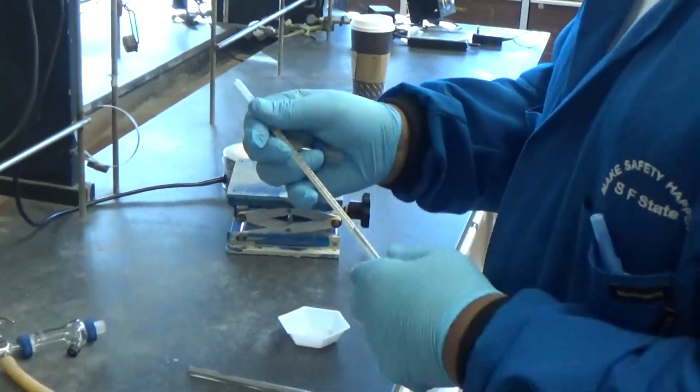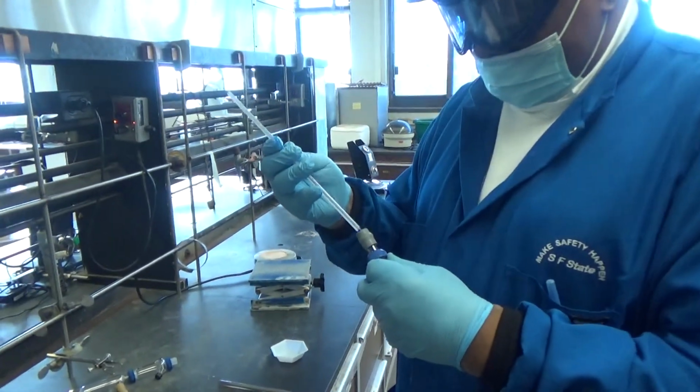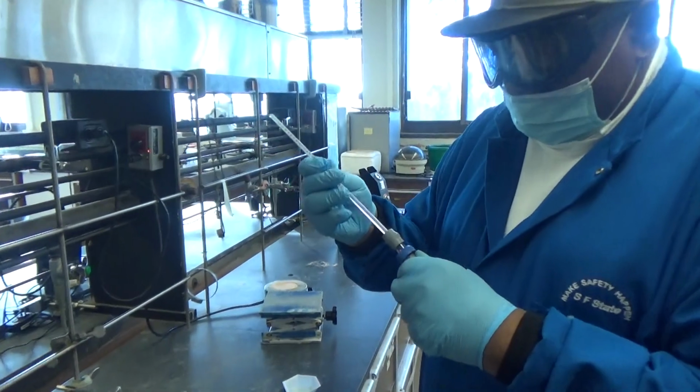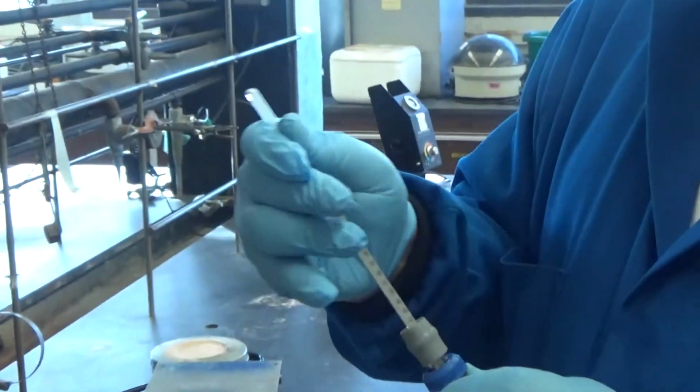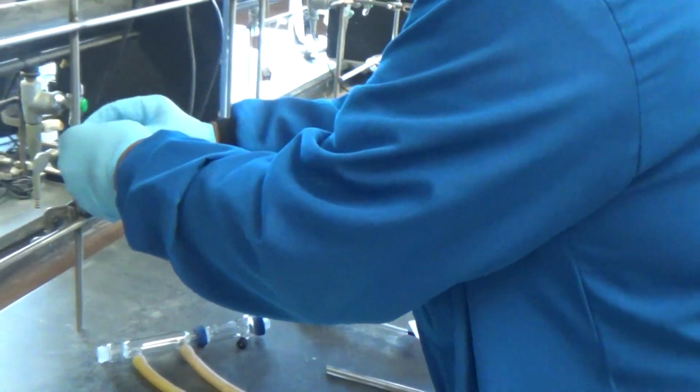Are we using mercury thermometers? No, no. It's in your research lab, yes, but yeah. Here I don't think it's good. Yeah. In the old days, we'd always use mercury thermometers, but the mercury's toxic. They know about that. Hopefully they know. Now they know. The red alcohol thermometers are less toxic.